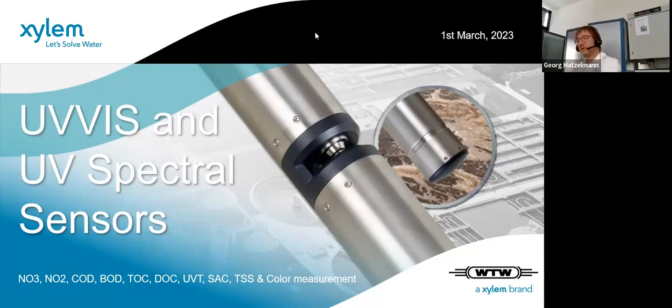Hello, good afternoon, good morning. Short introduction of myself: I'm the technical application specialist for this system. And now we will talk about how we can measure the different parameters with UV-Vis and UV spectral sensors. Next slide, please.